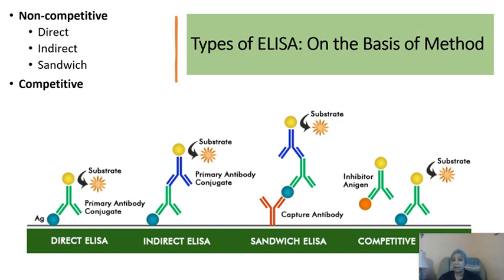So this is going to simplify your system, because only my galectin-3, your protein of interest, should bind to that capture antibody. Now you're going to come in with a second primary antibody against galectin-3 that binds to a different epitope than the capture antibody. So it can bind to another place on there. This is why it's a sandwich, because you have an antibody on the bottom and an antibody on top. This is going to really make that binding strong in this case.